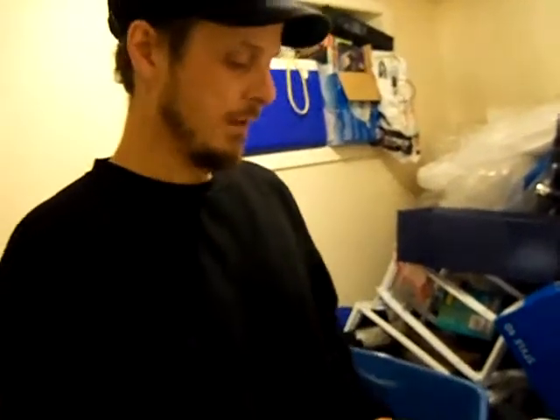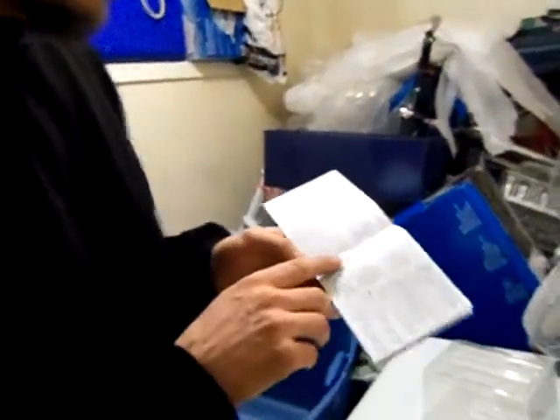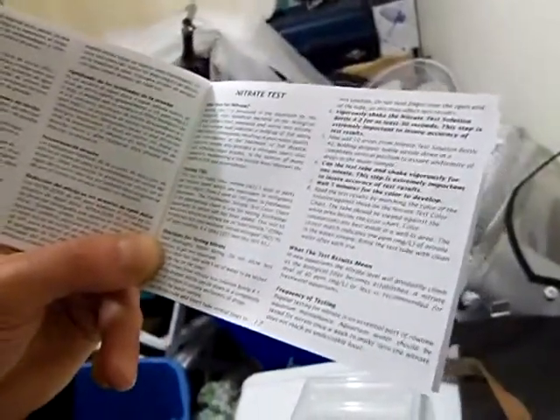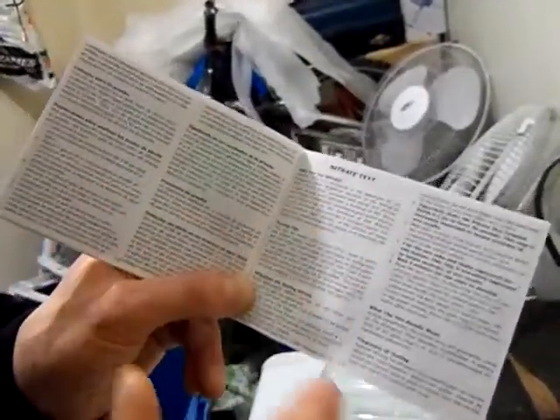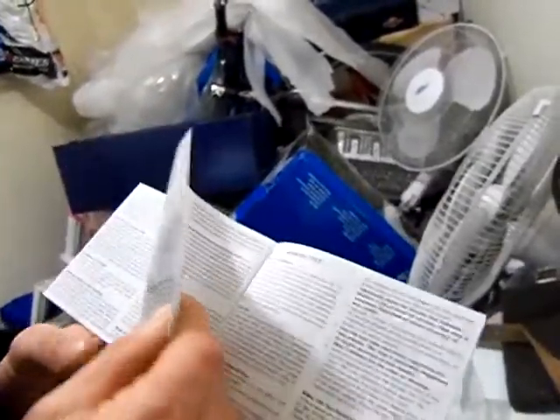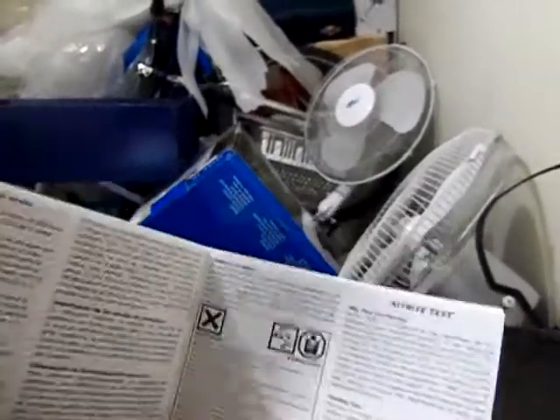The other thing I've noticed in the API Master Test Kit instructions: for nitrate, other kits give readings 4.4 times less than this test kit, because they're using something else to test the nitrate. And when it comes to nitrite, other kits are 3.3 times less than what API will give you.